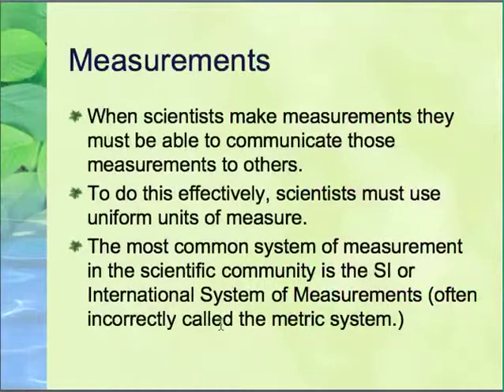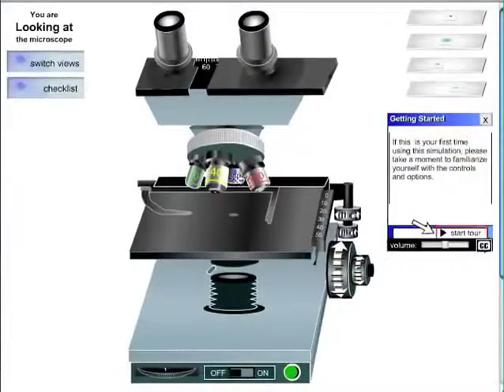All right, before we move on to measurements, I want to go over quickly this virtual microscope. Now, this is courtesy of the University of Delaware, and it is available on my website, mrdoc'sonlinelab.com. So just go to my site and go to Honors Biology. You should be able to find it, or to the related links page.